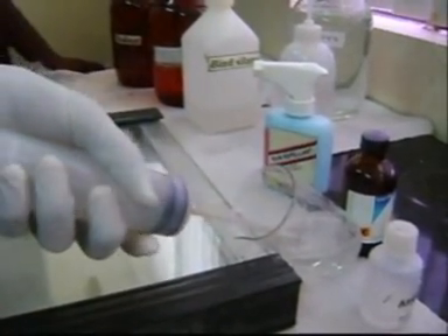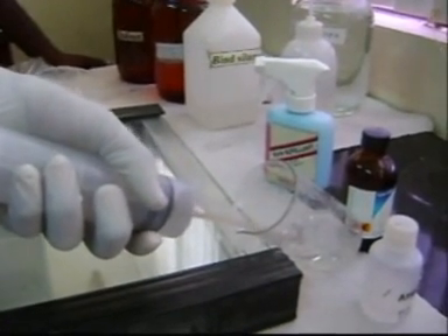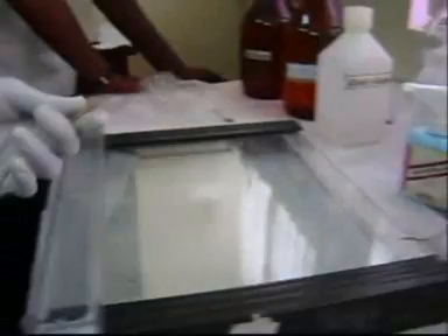Fill the gel solution into the syringe and place the tip from the bottom of the gasket. Then inject the gel solution in a vertical direction between the glass plates.